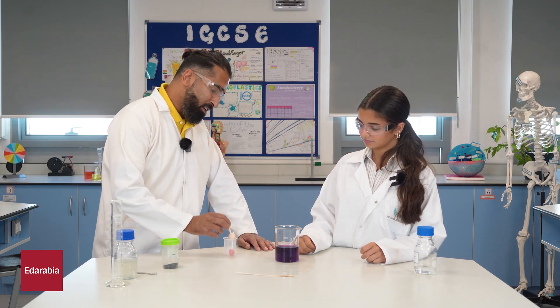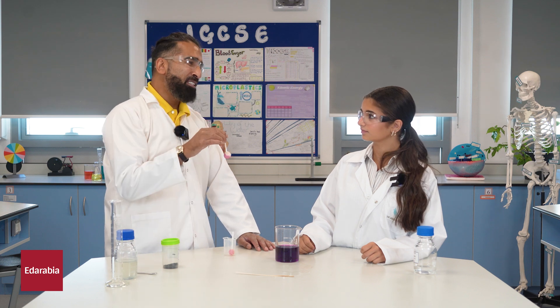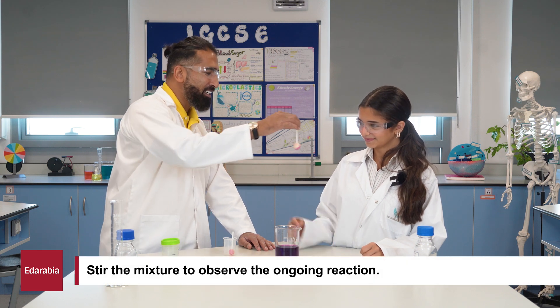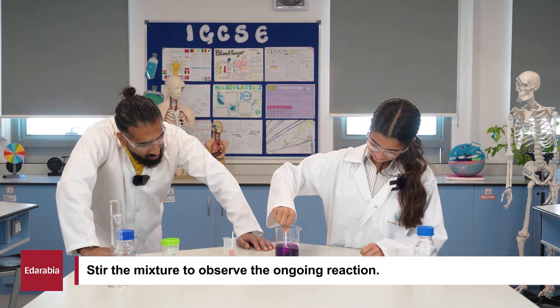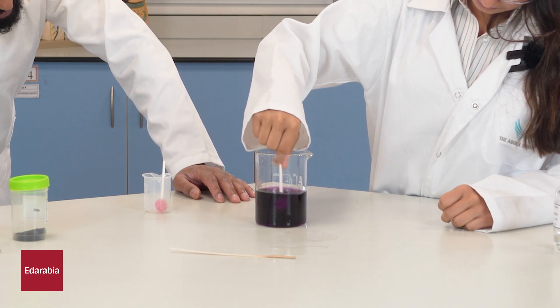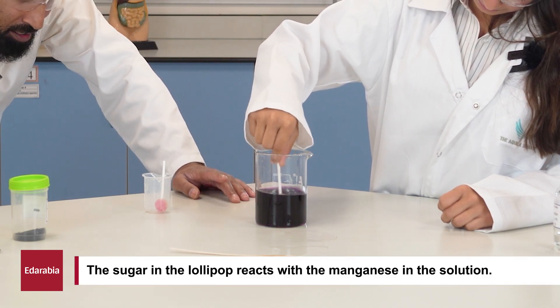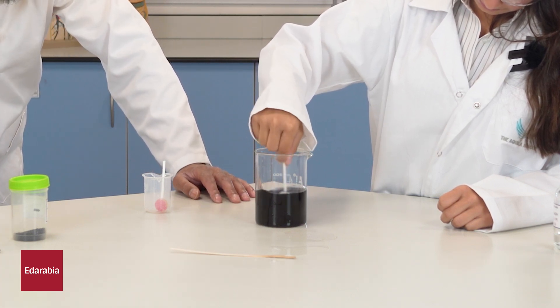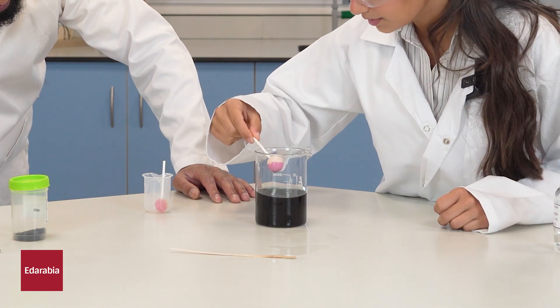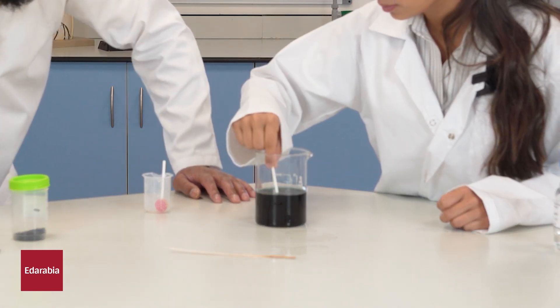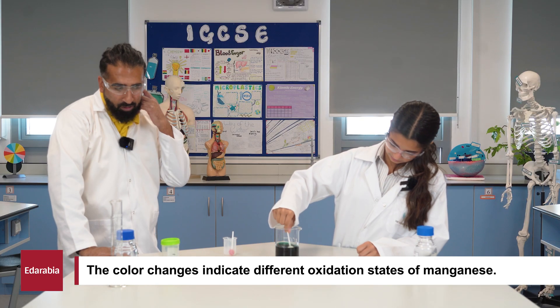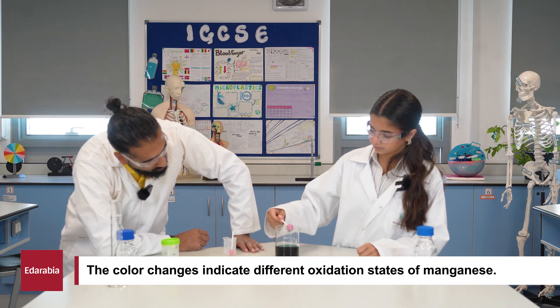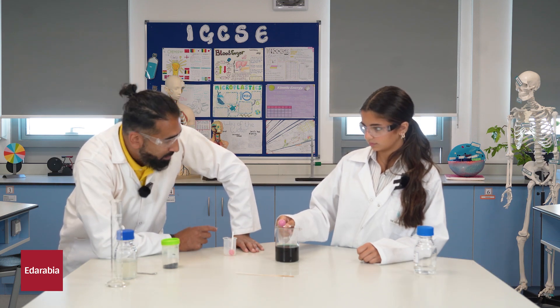Okay, let's have a look. So all you're going to do is take the lollipop — this means you won't be able to eat it afterwards though, are you okay with that? Okay, so take the lollipop in and give it a little stir and let's see what happens. So while you're mixing this, what we're trying to do is get the sugar to react with the manganese, and hopefully we should start to get — oh, we have got a slight change there. What's our change? Now it's black — oh now it's blue, blue, green. So as we're rotating through these colours we are getting a slight change in oxidation state, and what you've done now is you've probably given it an electron.